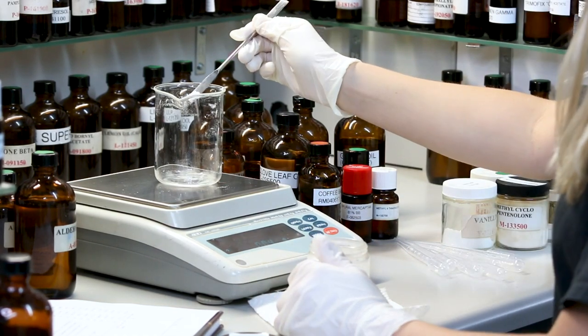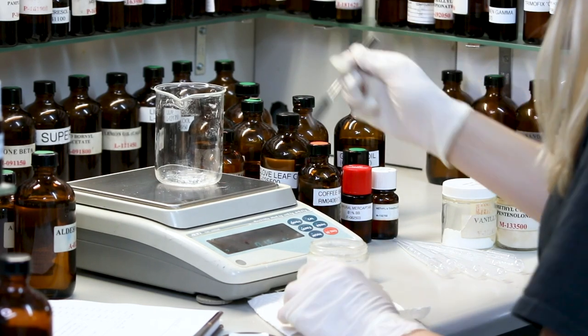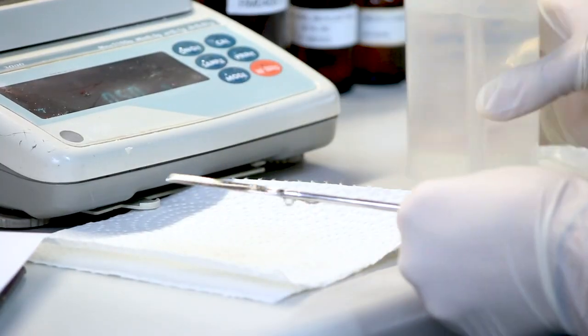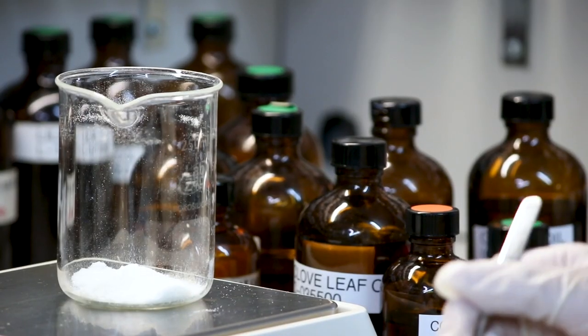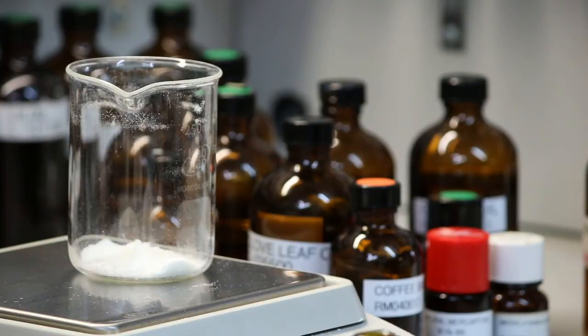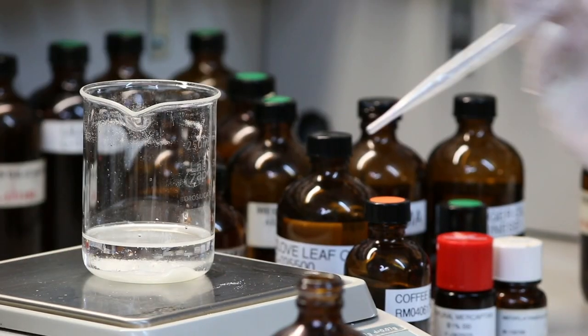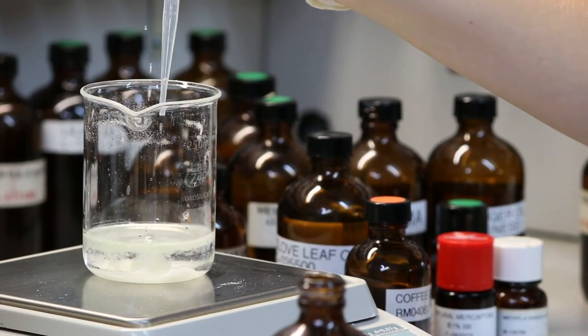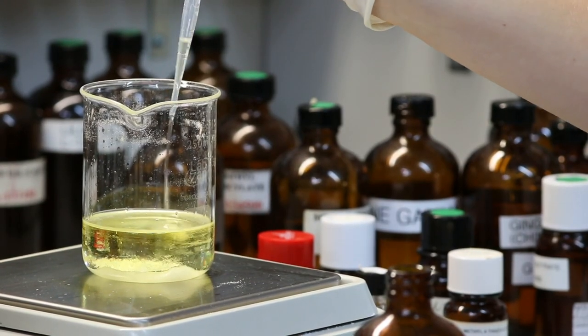The formula tells you exactly how much of what raw material is needed in order to create the fragrance. Be sure to clean the spatula after every use to avoid contamination. Now we're off to the liquids — a little bit of this, a little bit of that. You have to be careful; just one drop of the wrong thing can change the whole dynamic of the fragrance.